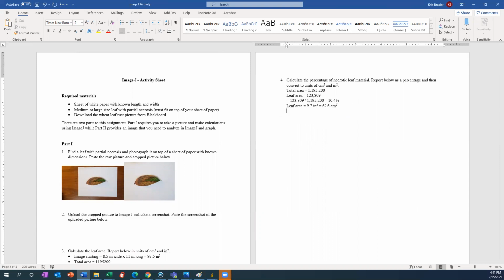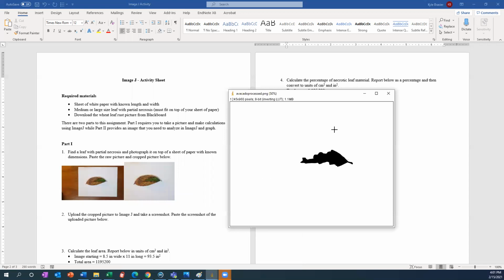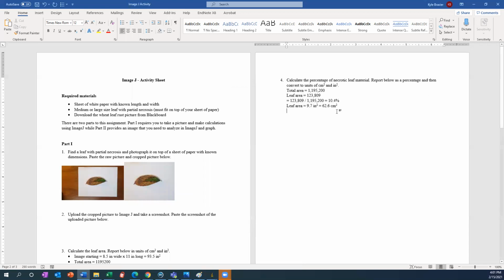So we saw that our green area of the leaf, this section here, leaf green area as opposed to leaf brown area, equals 24,228. All right, so what do we need to do at this point? We can calculate a percentage of green and brown area.